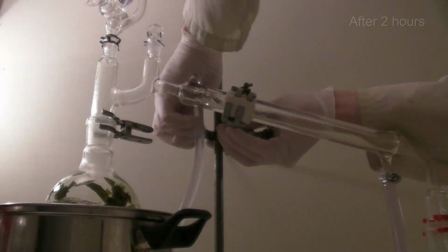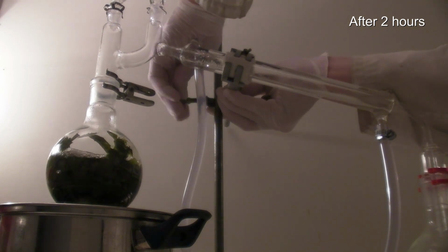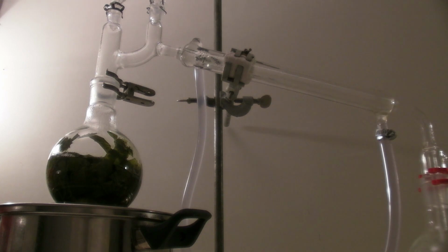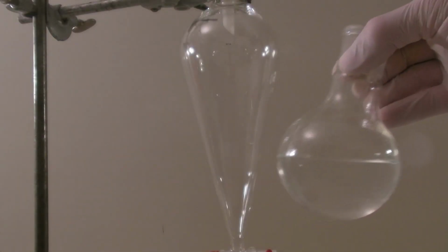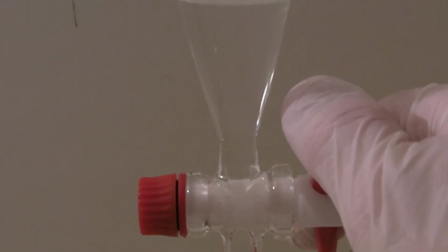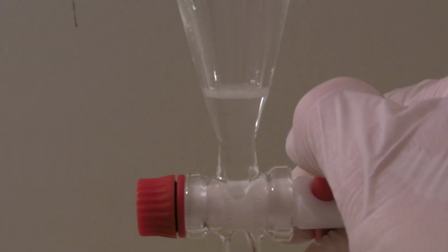After 2 hours, the distillation was stopped because the amount of oil in the distillate had decreased significantly. With this method, it usually has to be distilled twice the time or sometimes even for several days to get all of the oil. Then the mixture was added to a separatory funnel to separate the two phases. On separating off the water, it became obvious that only a very small amount of oil was obtained.